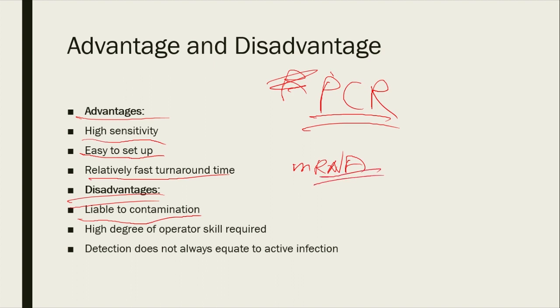So when I do RNA extractions, I usually need to clean the bench with bleach and 70% alcohol and wipe it out, tape it off, like off limit. This is for RNA only, because there are RNases everywhere. It will degrade your RNA very easily, and that is what is meant by contamination. So you lose the starting product already before you do anything else. Then that leads to a false negative, right? So that is a concern.